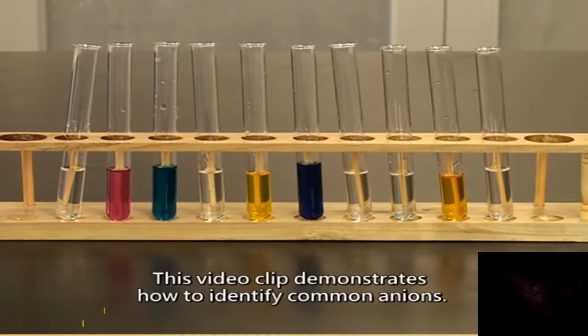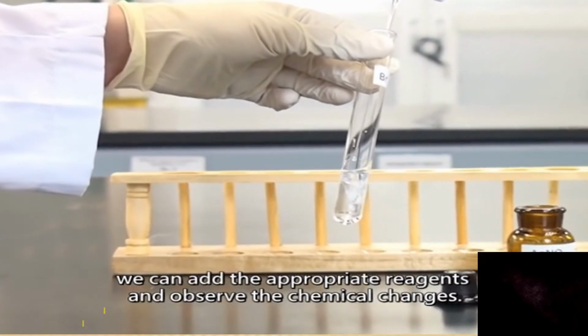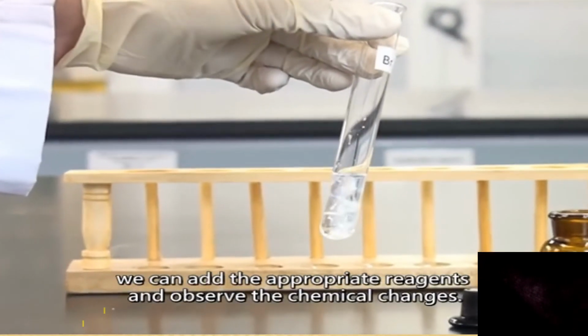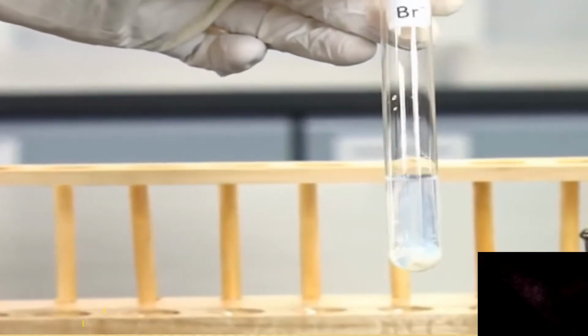This video clip demonstrates how to identify common anions. To analyze what anion is in the sample, we can add the appropriate reagents and observe the chemical changes. The following parts demonstrate the testing methods for common anions and the expected observations.